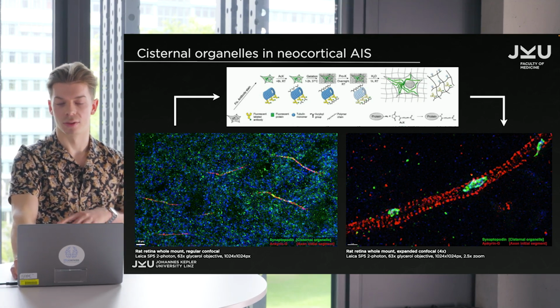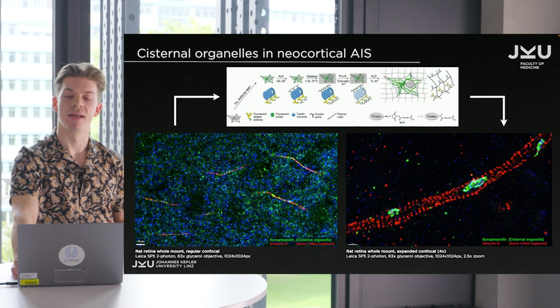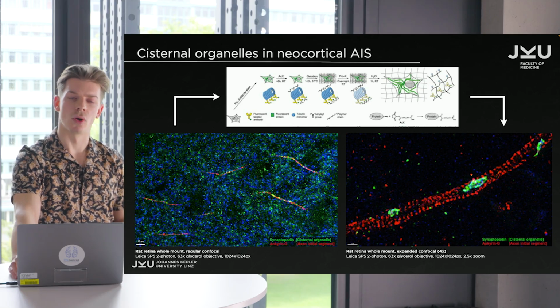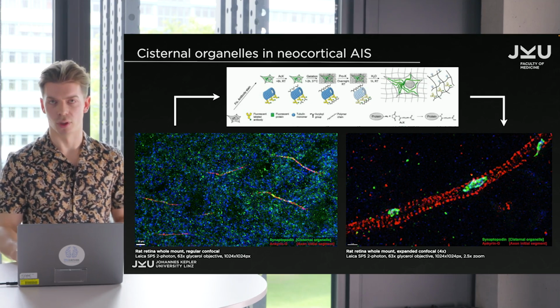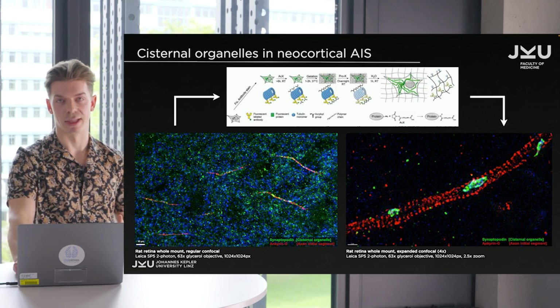And we also got quite nice 2D and 3D images of that. We still had the limitation that with this workflow, we could only get a very low throughput of our data. And in the end, all antibodies that were quite low binding, that didn't have the brightest signal, would get lost in the process. And by tearing the structures apart, we would lose all antibodies that have lower signal intensity.